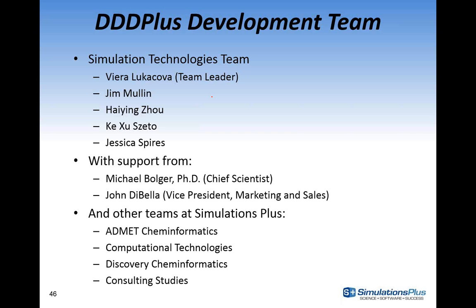It's going to take a bit more time. We're still adding physics to these models, and more complex physics, and trying to really hone in on some of the aspects of the degradation of the polymer, diffusion through the microspheres, the porosity and whatnot. So like I said, we do have working versions of a couple different models in-house, and I would expect that in the next version, we would be able to provide that model to the users.